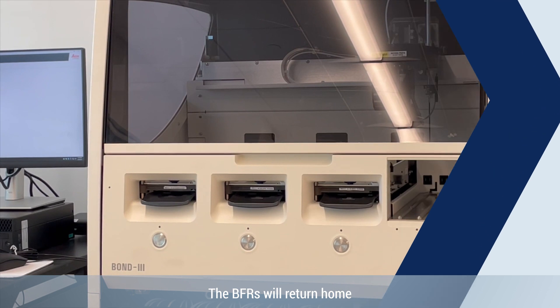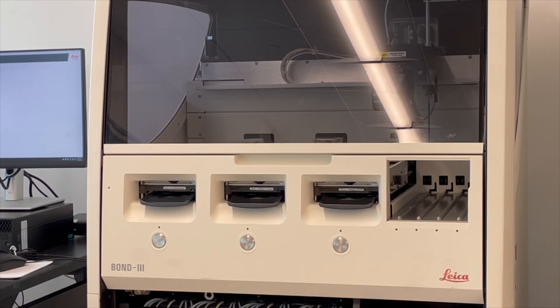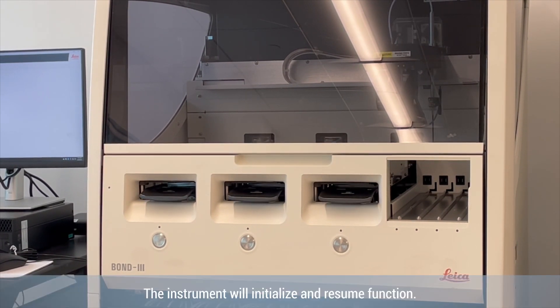The BFRs will return home and the trays will lift. The instrument will initialize and resume function.